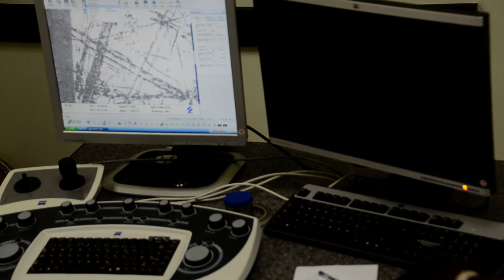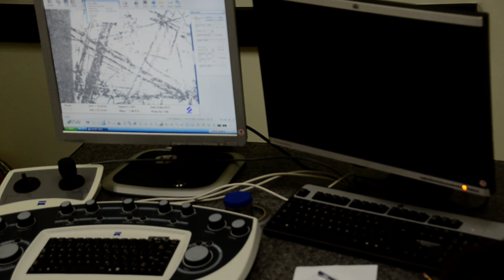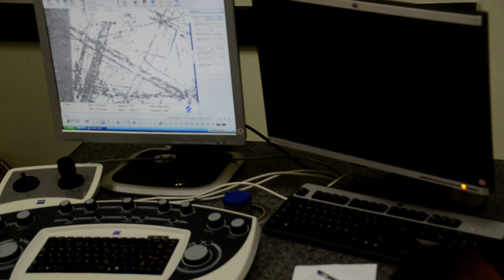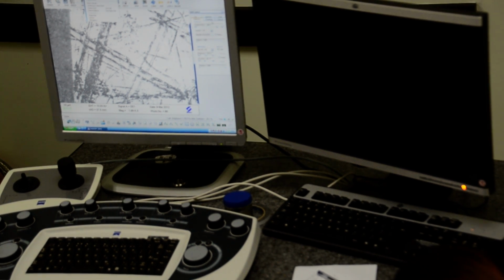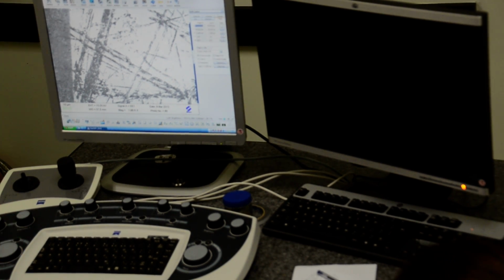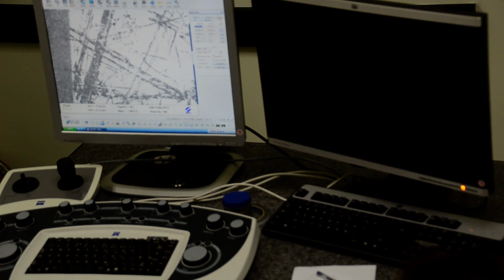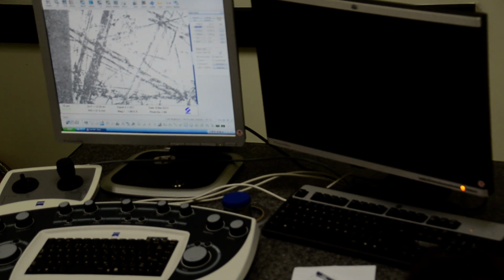Okay, so this is the stage, and there's another thing called stage initialize. For example, when you shut down the system, sometimes you will see everything grayed out here, because the stage has a coordinate system. They call it uninitialized. Then you need to do a stage initialize. Or if you touch the stage and a touch alarm happens, then you need to initialize the stage.